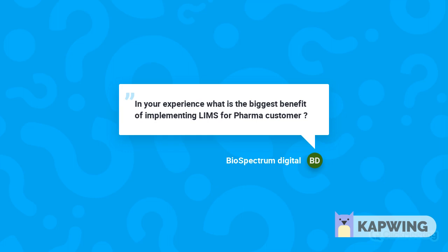Okay, so there's a few here. So one is, how much training do laboratory users need to undergo before they can start using LIMS, and do you support the training? Okay, so it depends on the level of the user that you're training.